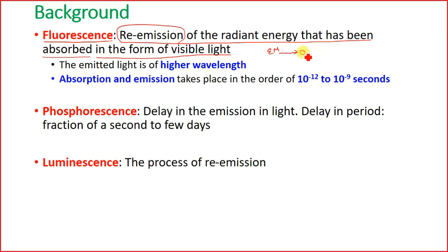then it absorbs some of the light, it may transmit some of the light, and depending upon the nature of this molecule, it may emit some radiations. Okay, it may emit some radiations in the spectrum of the visible light. Okay, so that is called fluorescence.